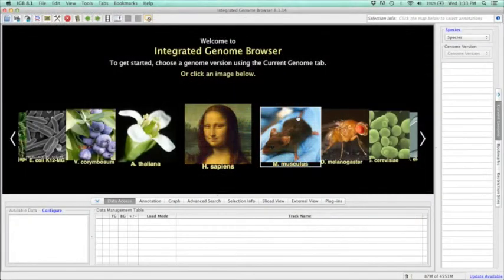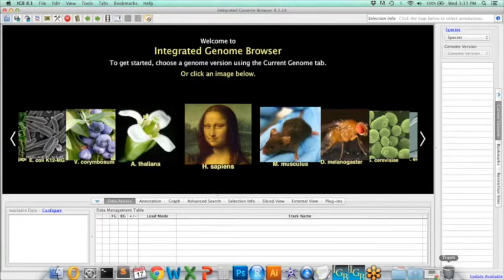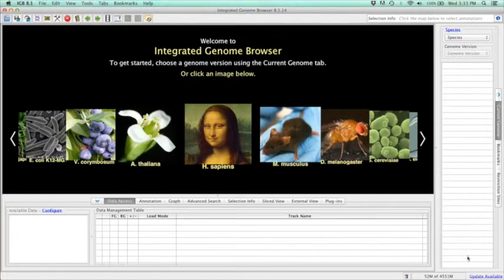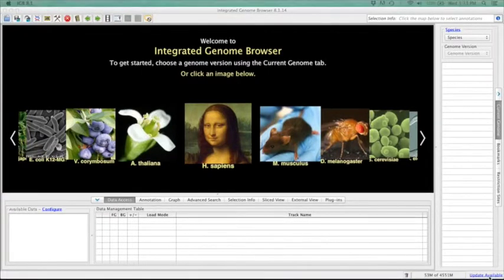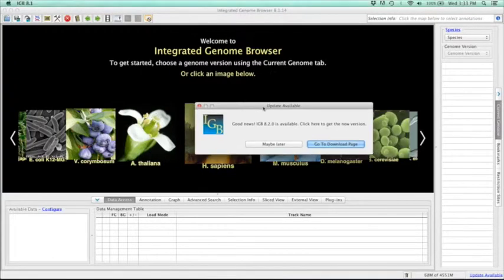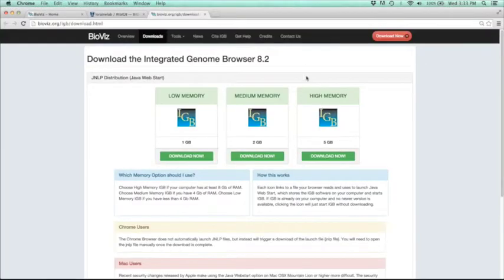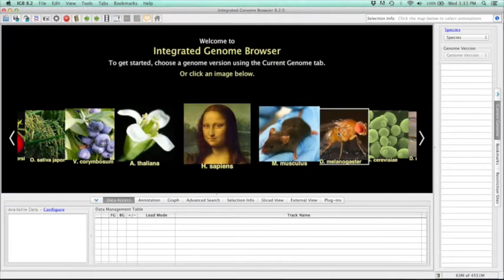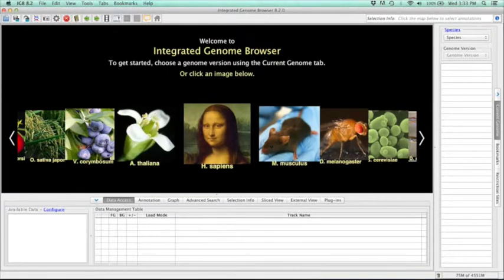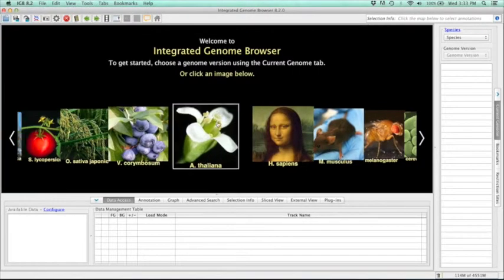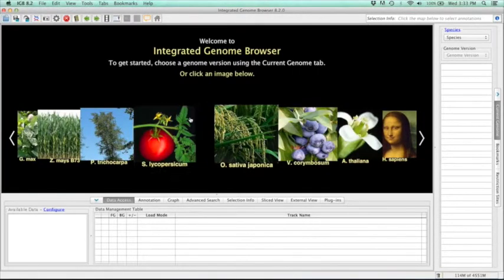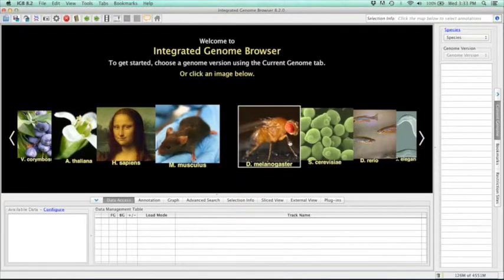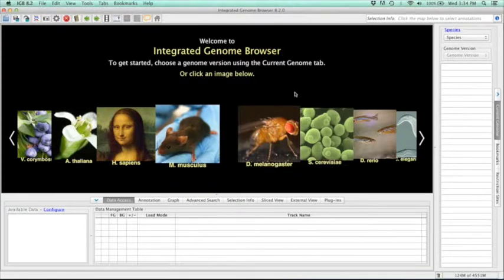So to start off, if you're running an older version of IGB, you'll notice that in the bottom right-hand corner there is a notification that states an update is available. If you click on this, you'll get this notification or you can go to the download page and get the newest version of IGB. So once you have the new version of IGB, the first thing you might notice is that we've added several new genomes. Some notable include the tomato genome as well as the most recent version of the fly genome. And both these were just updated this year.